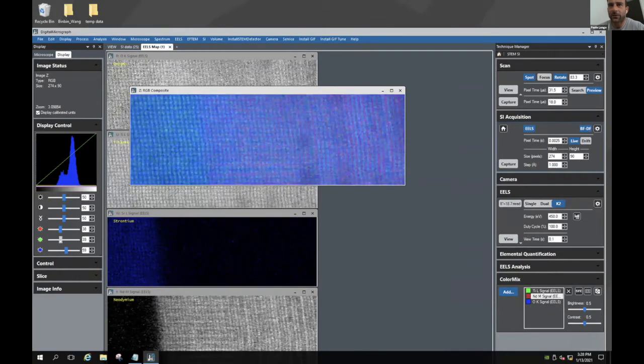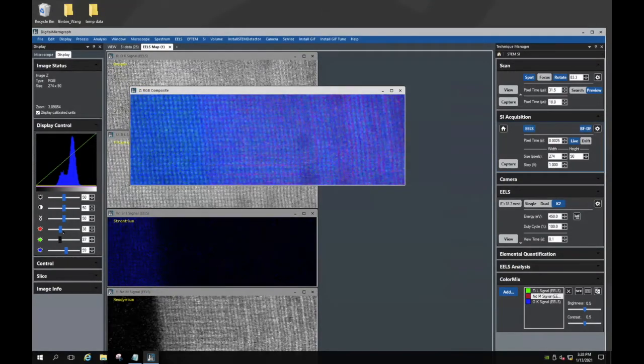Does it make any sense, Robert? It could. I mean, right, we're expecting this to be an ionic conductor, so. The area that this scan is collected isn't, remember the other one had much larger black regions. Yeah, but this one we're not sure. You can see in the neodymium how the contrast varies, right?